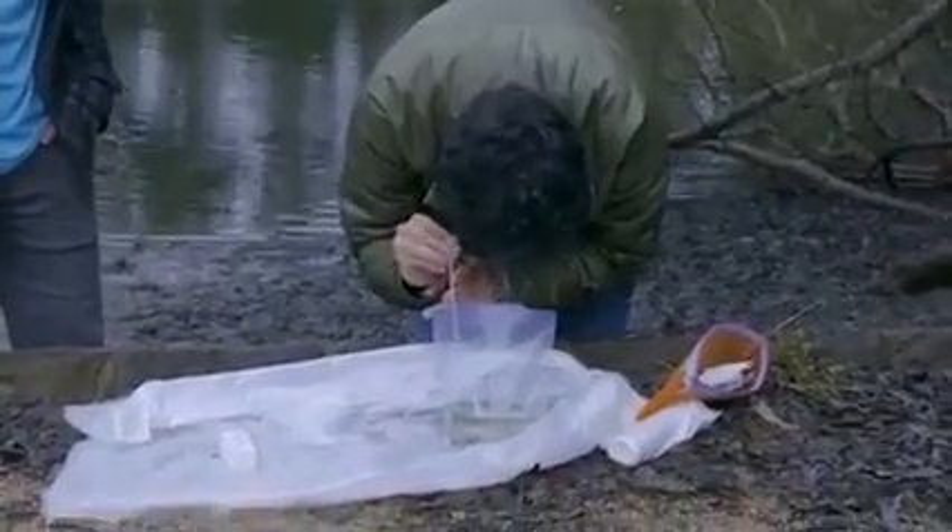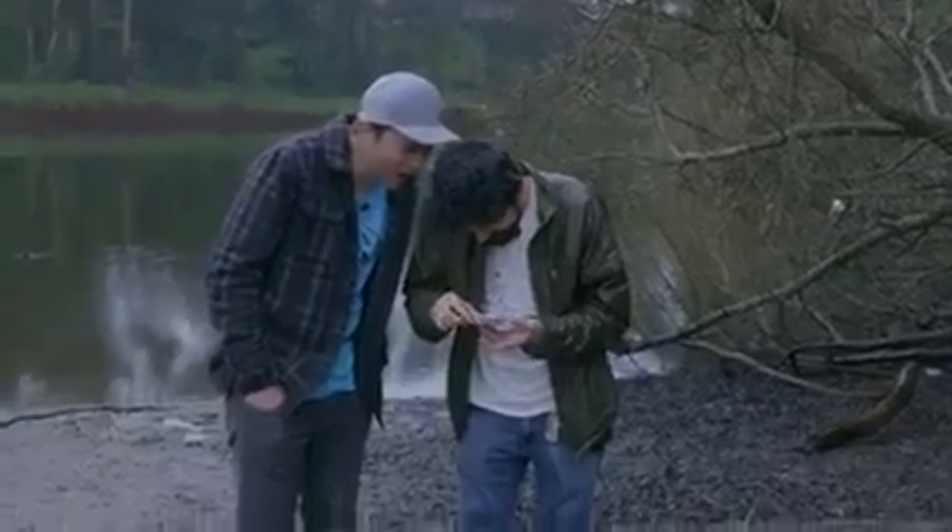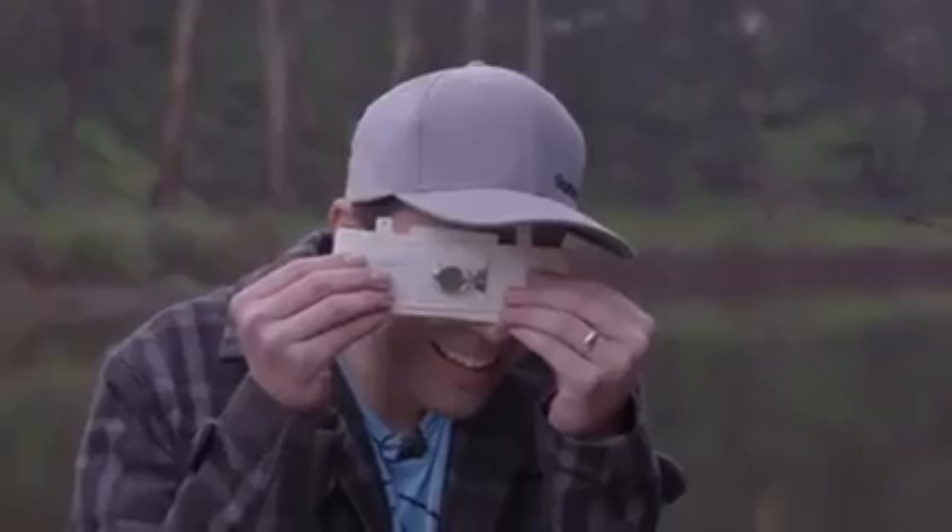But I think I'm going to get it. There it is. And remember, to the naked eye you can barely see this tiny white speck. That's the single eye — you see that? And then we look at the back: those are the egg sacs. Dude! I was not kidding. This might be 10, 15 eggs on each side. Those are antenna. So when I was sucking it in and it ran away — it senses the pressure variation through those. That is so crazy.